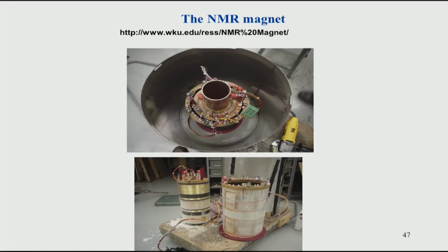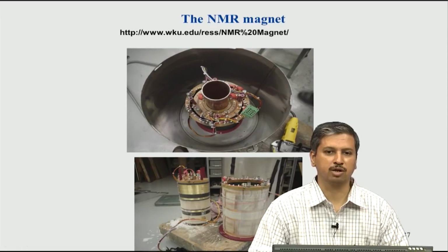So, liquid helium very slowly evaporates, and one has to refill helium once in a few months, because slow evaporation is always unavoidable. In the modern day, there are systems where you can actually recirculate the liquid helium. So, whatever is evaporated, you can condense it and bring it back. So, you can have what is called a closed loop system, the closed system. The only thing is that it causes some kind of vibration.